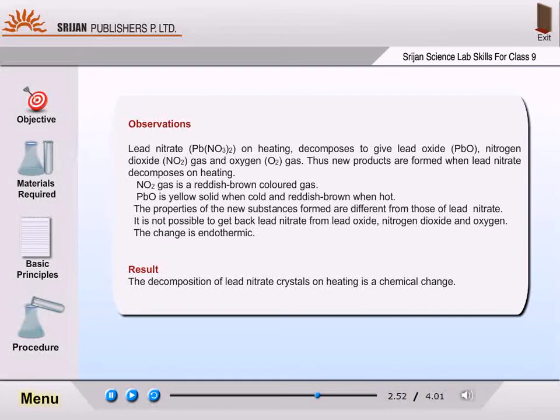Lead nitrate (Pb(NO₃)₂) on heating decomposes to give lead oxide (PbO), nitrogen dioxide (NO₂) gas, and oxygen (O₂) gas.